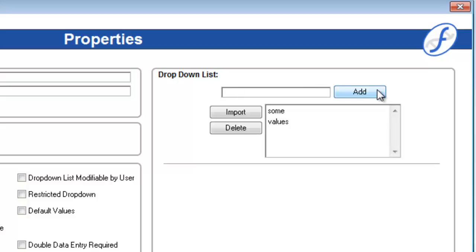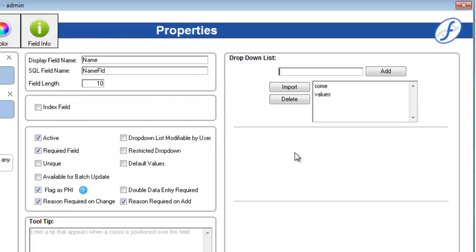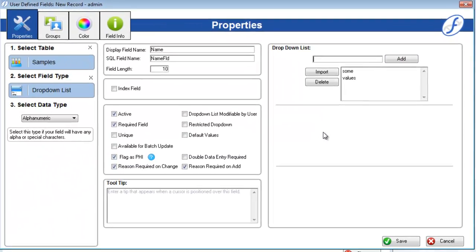Now we have two drop-down list values, some and values. Of course, you can also check on drop-down list modifiable by user, so that users aren't confined to the values you enter here.